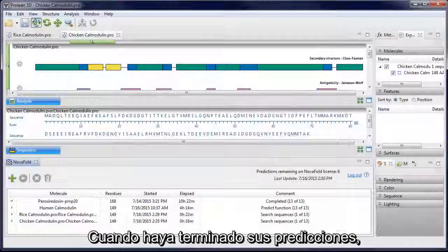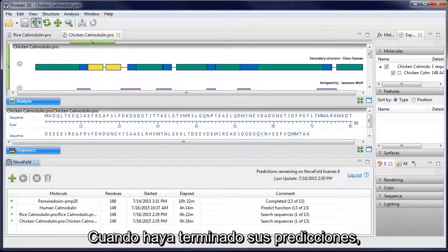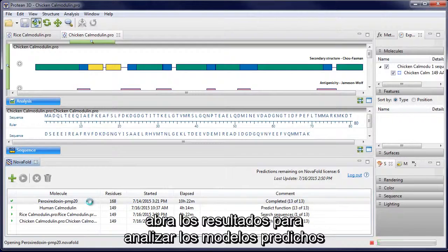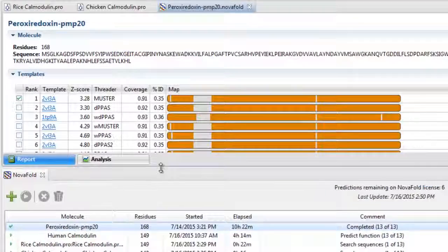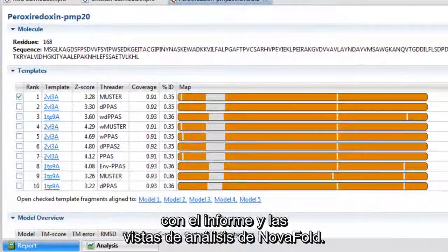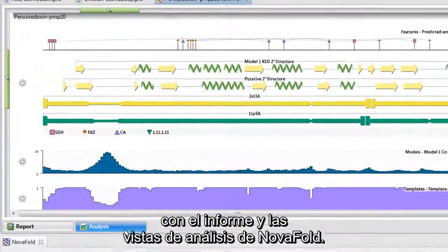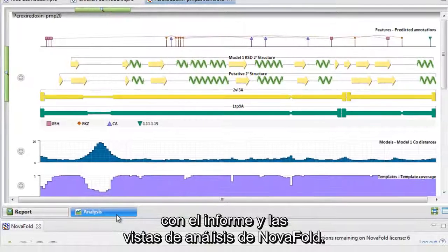After your predictions are complete, open the results to analyze predicted models using the NovaFold report and analysis views.